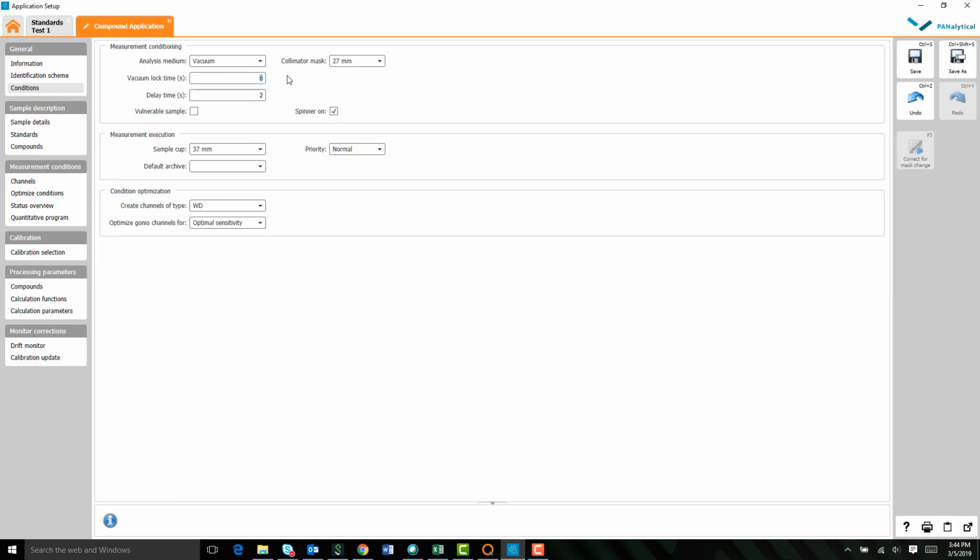I'm going to bump this up a little bit. Go to 10 seconds and 4. Just a little easier on the hardware there. Vulnerable sample would be like your liquids and your powders. We're not going to turn that on. We will keep the spinner on.